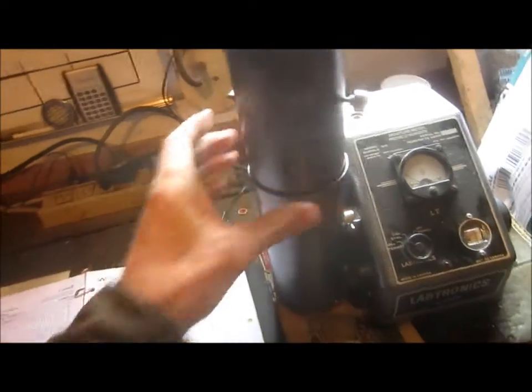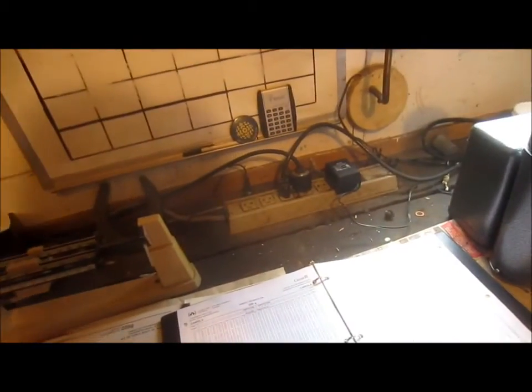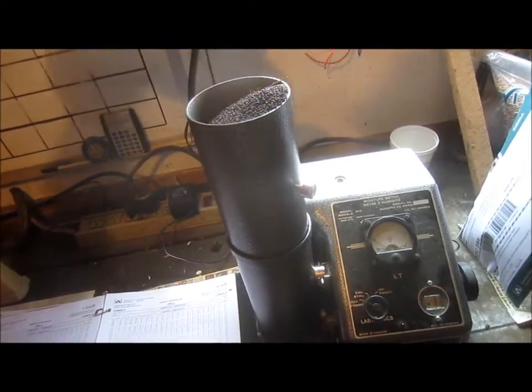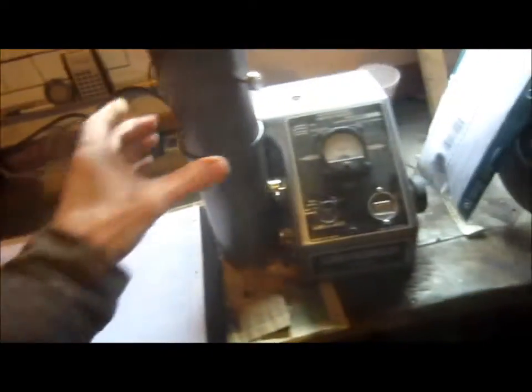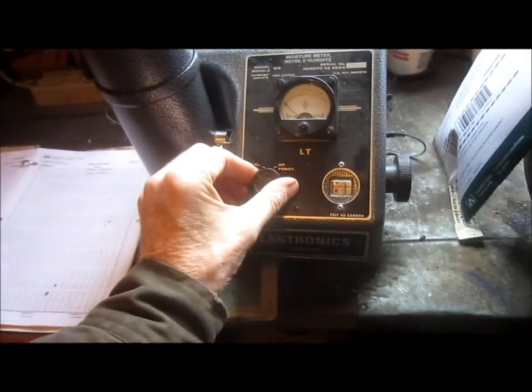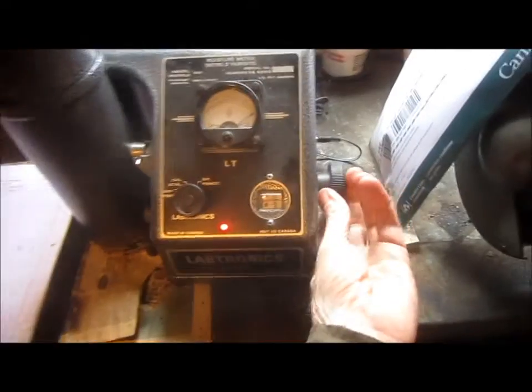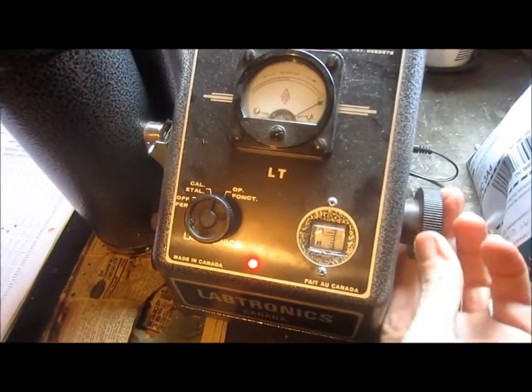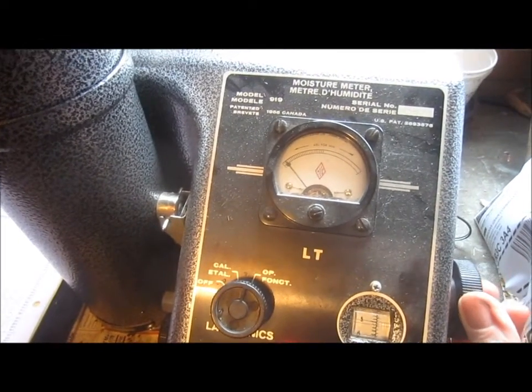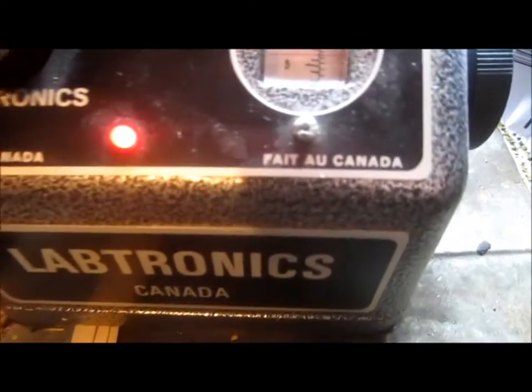Set the funnel on top of the tester, dump the canola down the spout — oops, spilled a few grains, probably not a big deal — and release the button. Turn to operate. You'll want to set your needle to as close to zero as possible. Once it's on zero, take your reading off the scale. This stuff is really dry — it's showing just over number five.